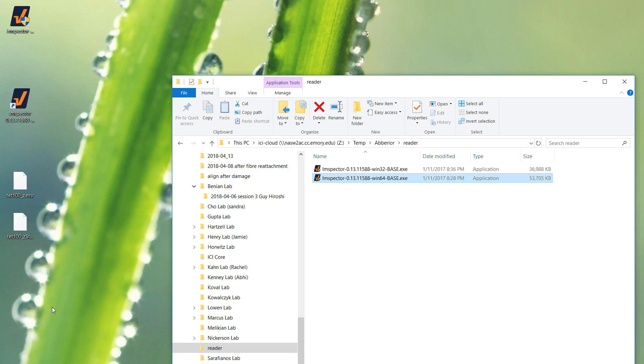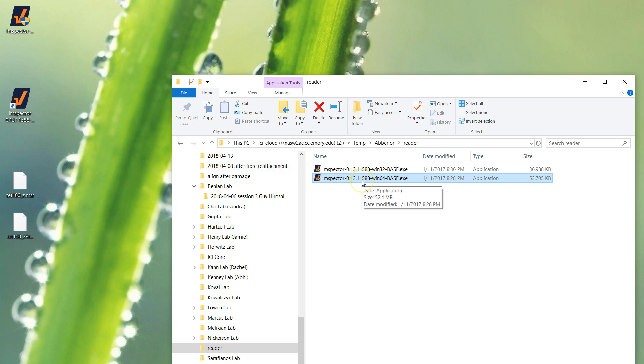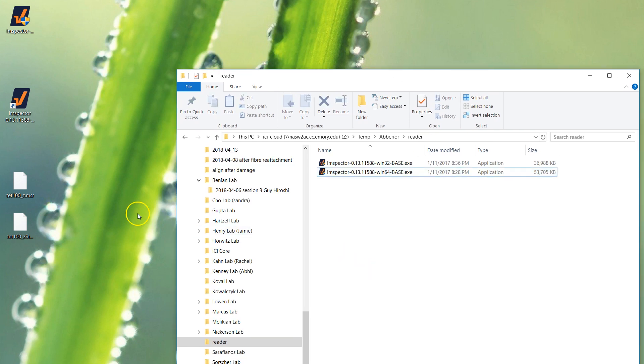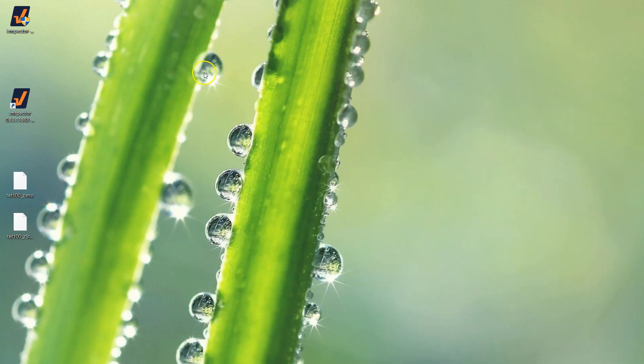Okay, so for the Abberior STEAD demo datasets, we have the Imspector software that you can download from the server in the reader folder and install. Go ahead and use the 64-bit. It has to be Windows and you have to have admin rights on your workstation or computer. It's pretty lightweight, you can probably do it on your laptop. I wouldn't recommend 32-bit. I don't think many people have 32-bit computers anymore, so default to 64 and see if it doesn't work.